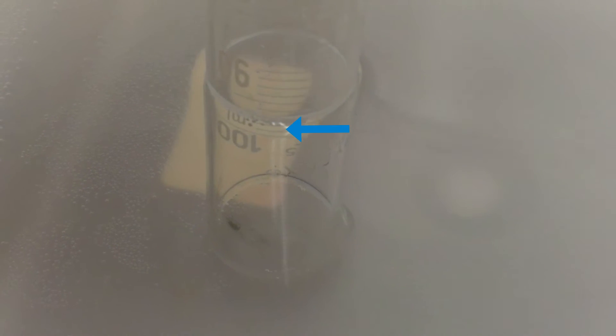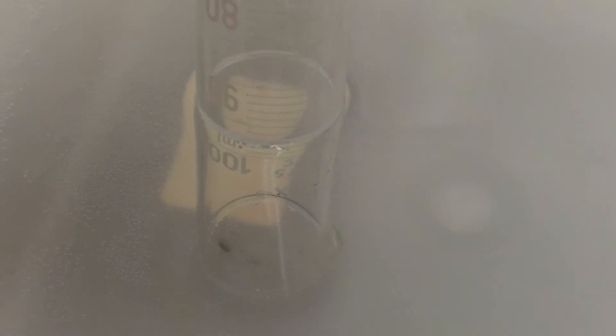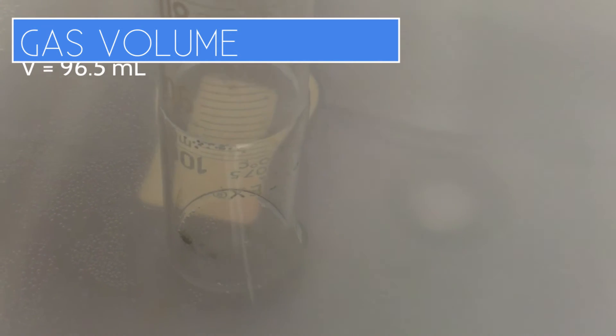When I match the water levels, the water outside the graduated cylinder is being pushed down by atmospheric pressure in the room, while the water inside is being pushed down by the gas inside — butane plus water vapor. If I make the water levels match, the pressure of the two gases inside the graduated cylinder equals the pressure in the room. There's a bit of estimating here, but it looks like a volume of 96.5 milliliters.